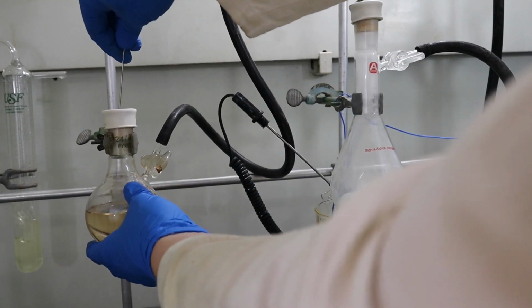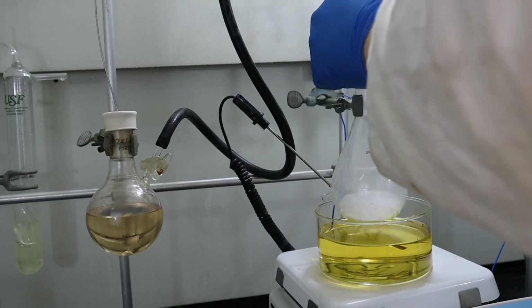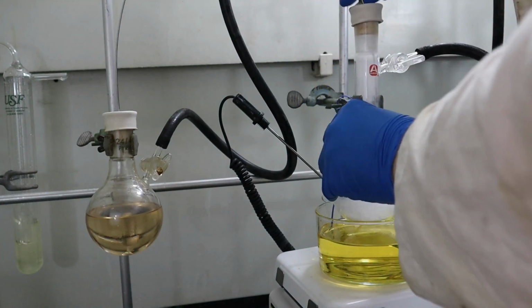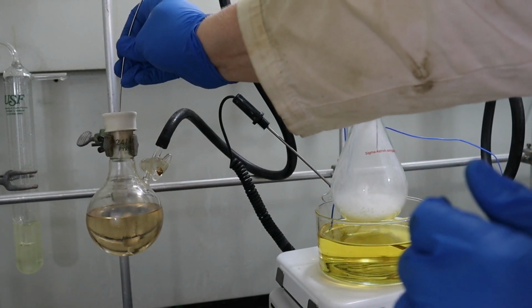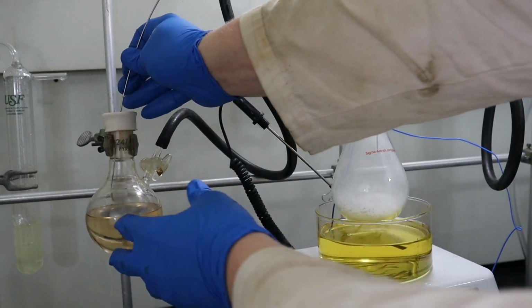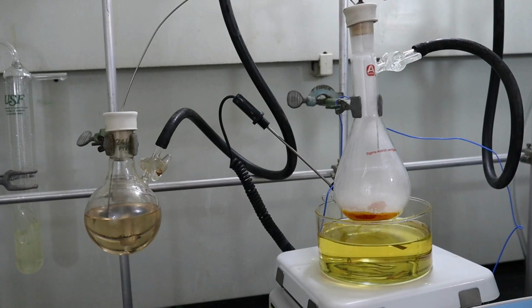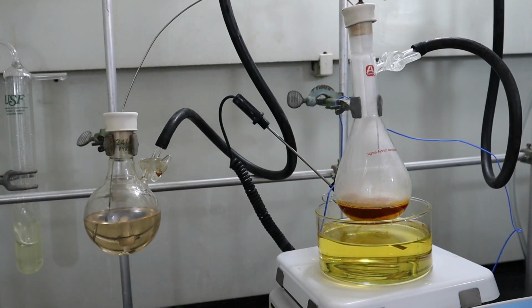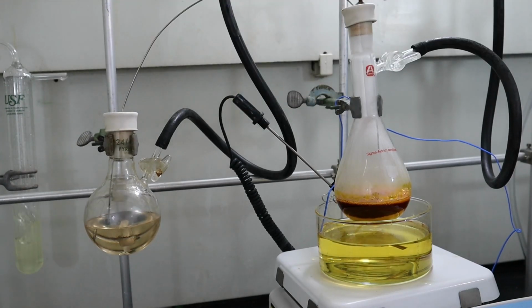With a slight positive pressure of nitrogen, I passed a cannula, a long double-ended needle, through the septum. I then put the other end of the cannula through a septum on a flask containing 57 grams of aluminum chloride, a moisture-sensitive catalyst that was transferred into the flask in a glove box. By opening the aluminum chloride flask to vacuum, the naphthol solution is drawn into it. This is called a cannula transfer. The reaction produced a striking red color, a good sign that something was happening.